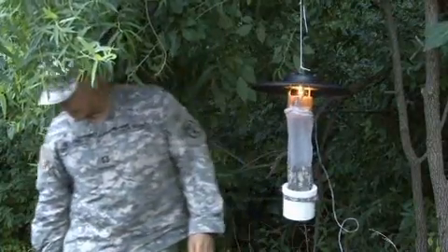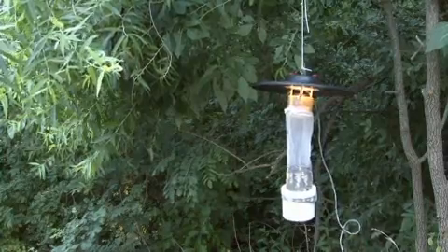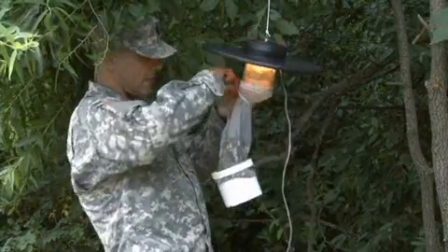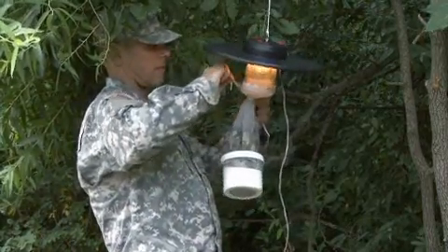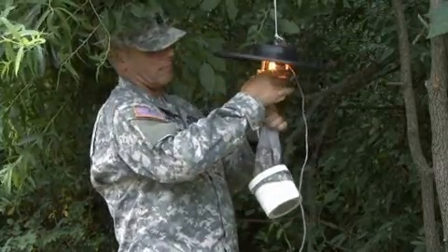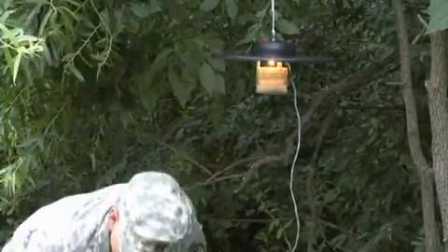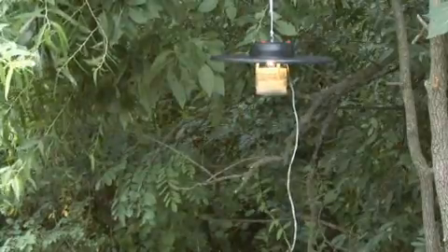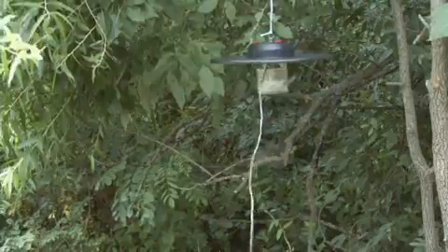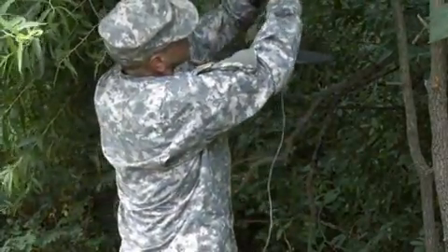Dry ice, if available, may be used to augment the light trap to increase catch results. Return to the light trap the following morning — it is important to retrieve specimens from the trap as soon as possible, as it is easier to sort and identify fresh specimens. Tap the sides of the collection container to encourage the specimens to fall to the bottom, then tie off the top of the collection bag and remove the collection container from the trap. Place the collection container into a cooler with dry ice for at least 30 minutes to kill the specimens.